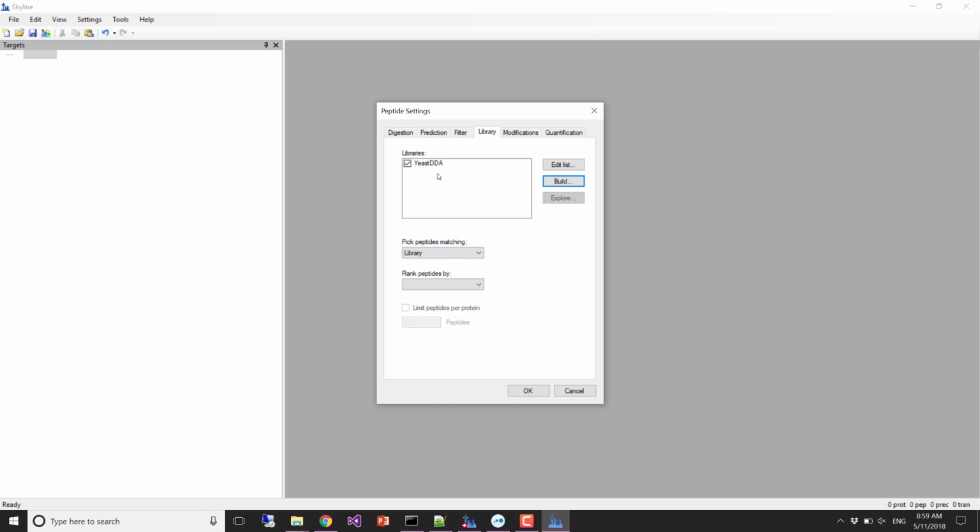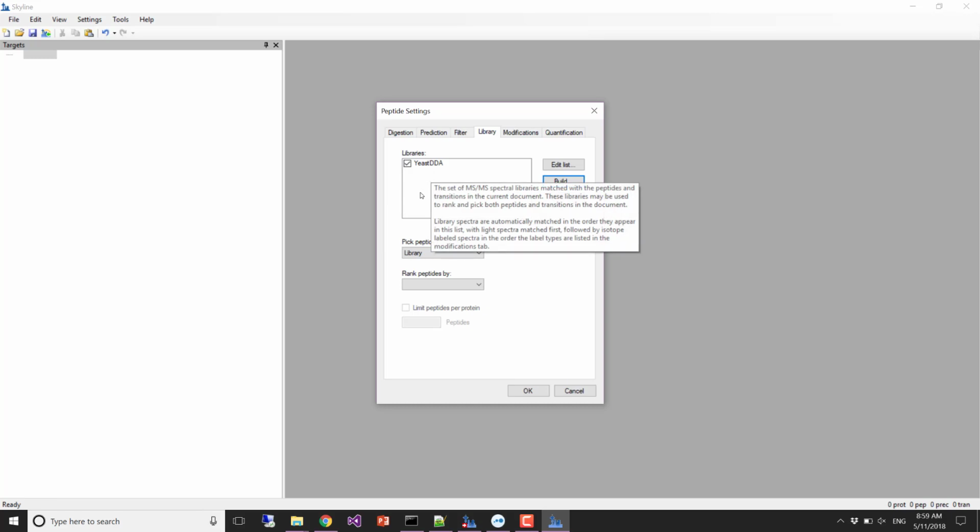All right, so let's keep going here. Luckily I'm the one who goes next, so I'm just going to run a little bit long on the morning session because it doesn't look like absolutely everybody's here yet. So let's keep going to where we can actually import some data here.